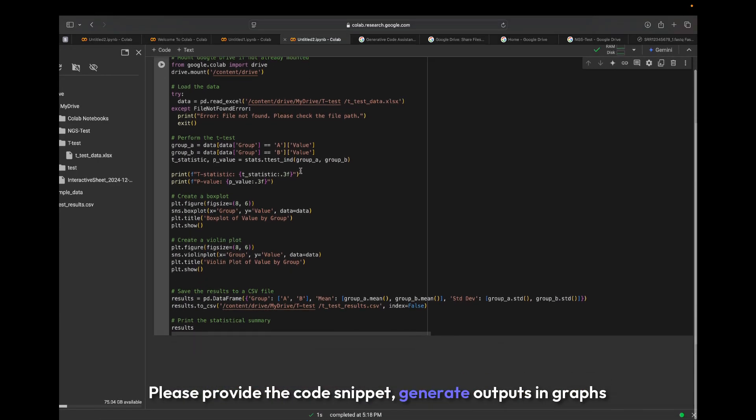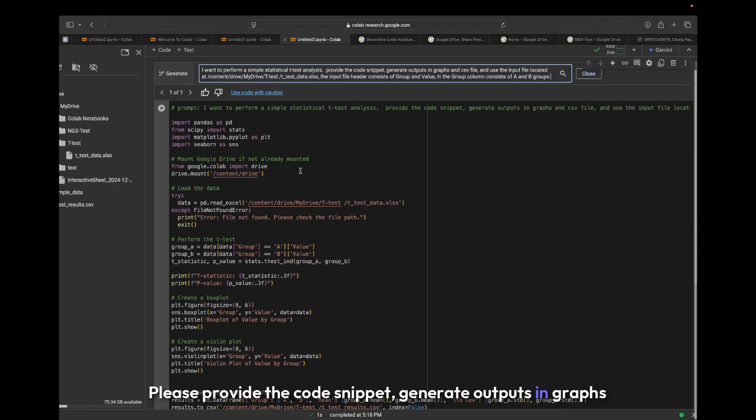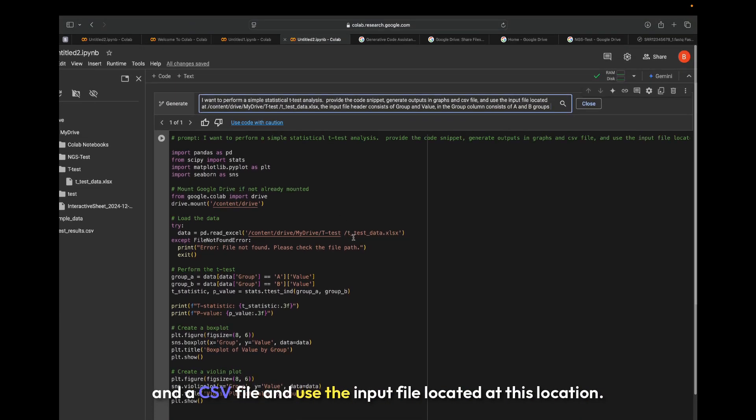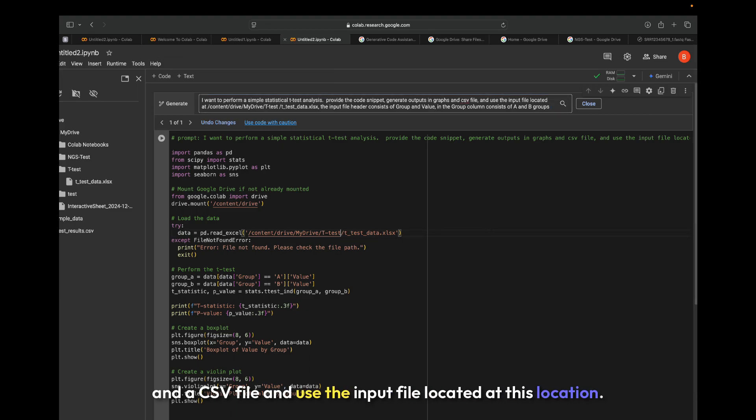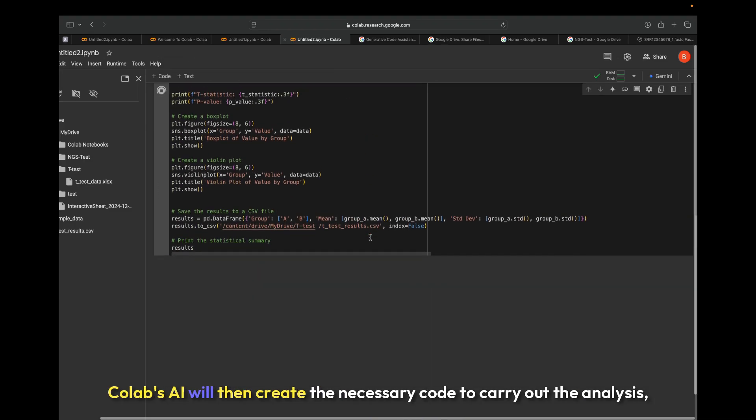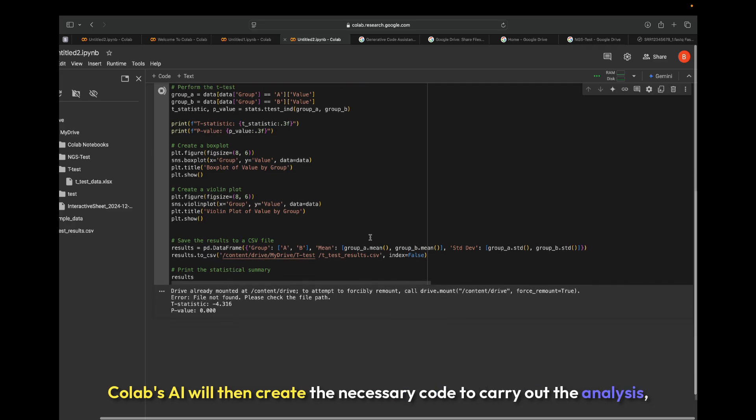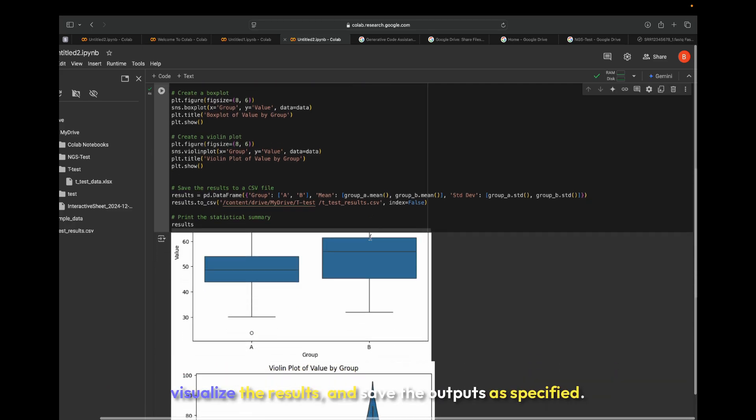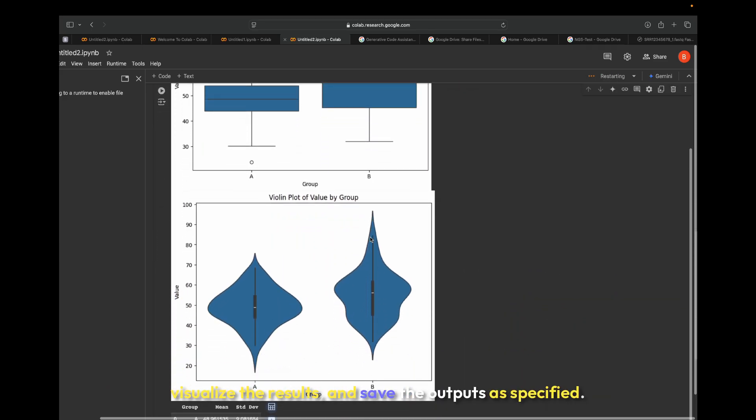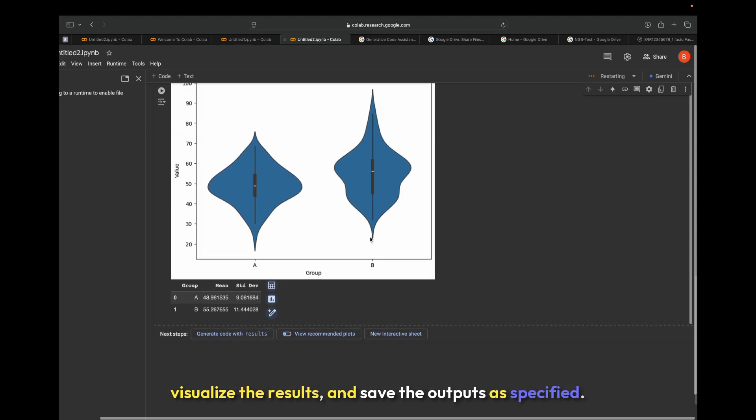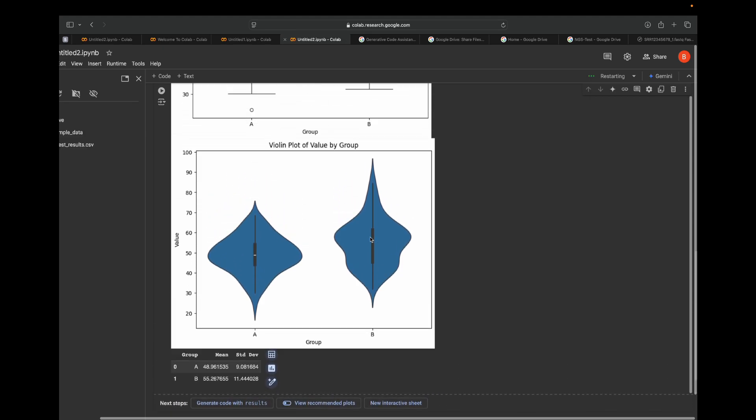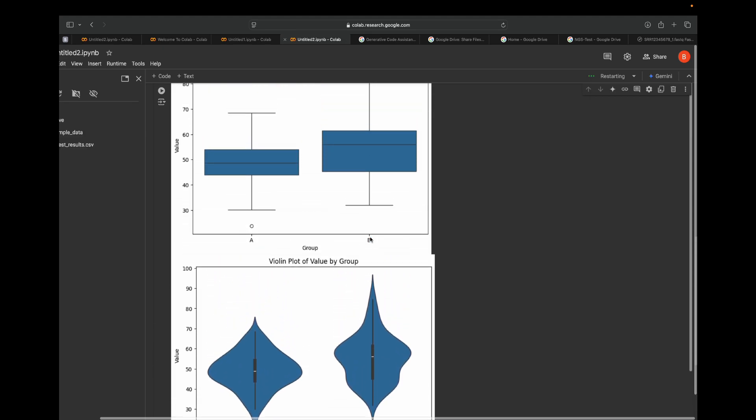Generate outputs in graphs and a CSV file, and use the input file located at this location. Colab's AI will then create the necessary code to carry out the analysis, visualize the results, and save the outputs as specified.